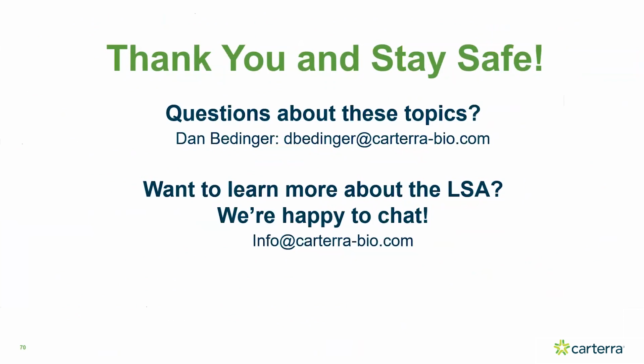Here's a question. How do I know if the antibodies are immobilized at too high of a density? Second part, what can you do to ensure that capture levels are appropriate for a screen?